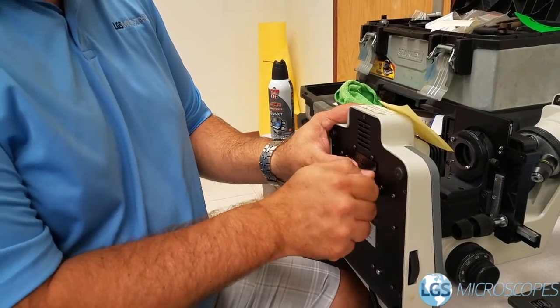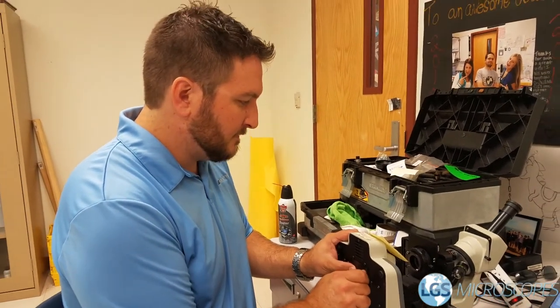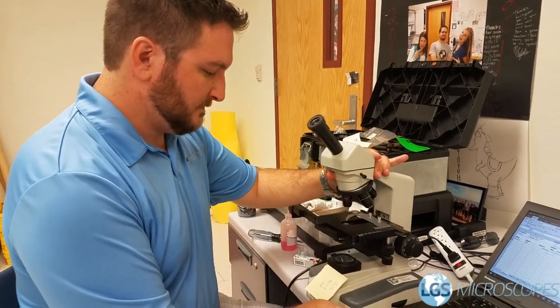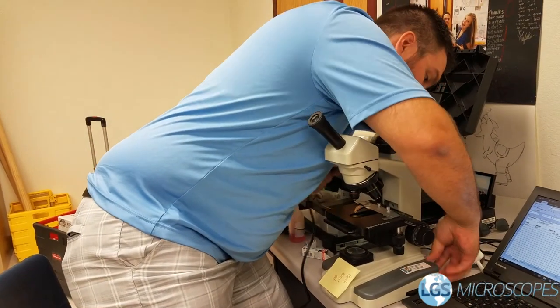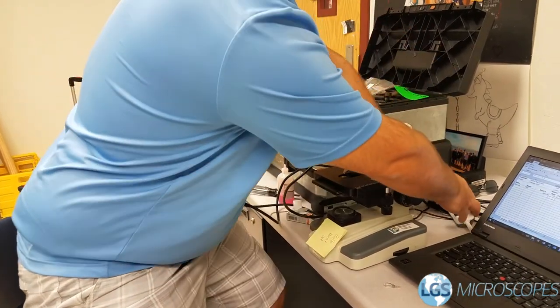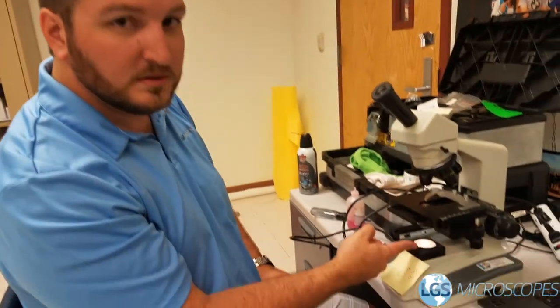Close the door again. Set it back upright. Plug it back in, and as you can see the bulb is fixed — it's that simple. If you have any questions, you can contact us via email at info@lgsmicroscopes.com, or you can call us at 623-240-2232. Thanks.